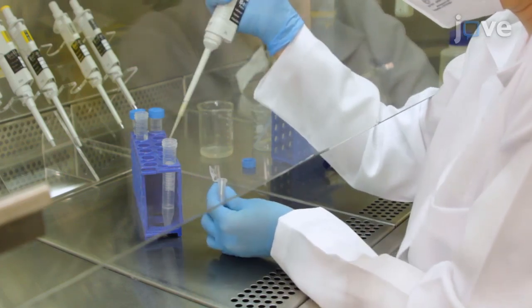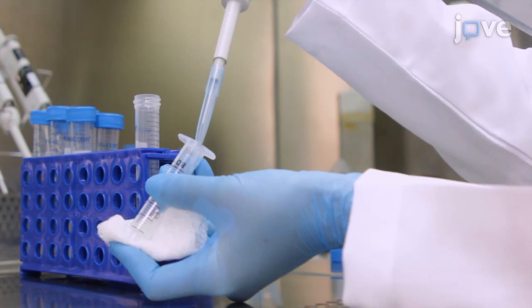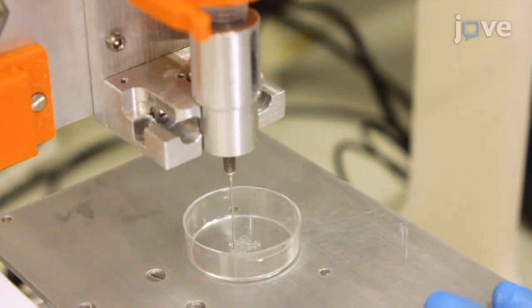This protocol can be applied to the biofabrication of other soft tissues, as it is based on the 3D bioprinting of a bioink composed of natural polymers and extracellular matrix components.